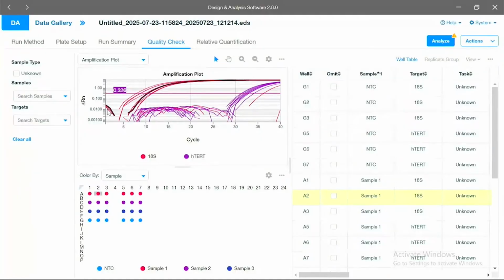Caveat to that is if you assign the whole plate with a sample name or target name, it will go ahead and use all of those wells for that assessment. So if you only have 5 samples in a plate, you now have most of the plate being erroneous data, and you'll likely get some weird reports back. So just make sure that the assignments are only for sample-containing wells.